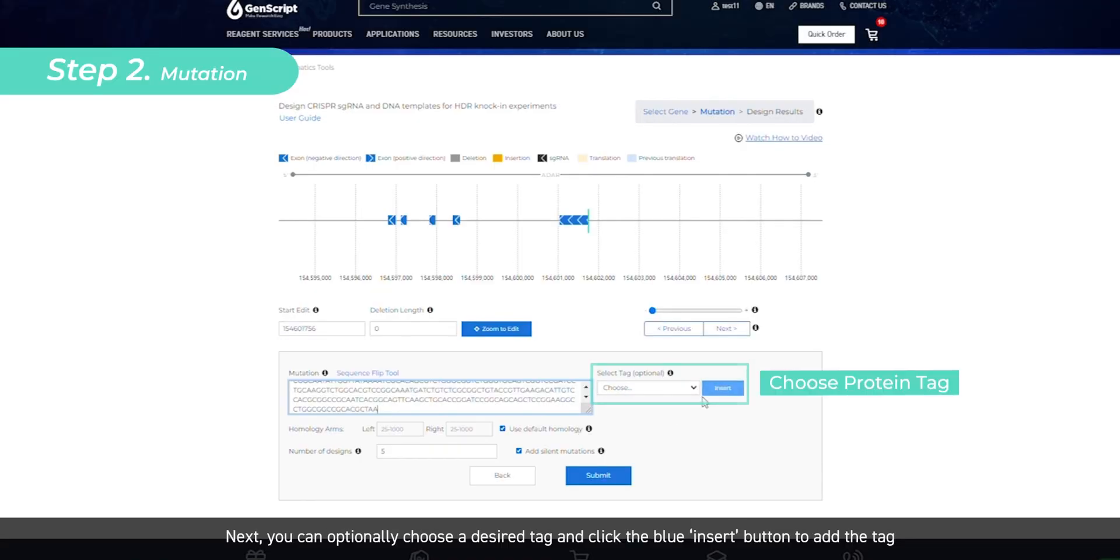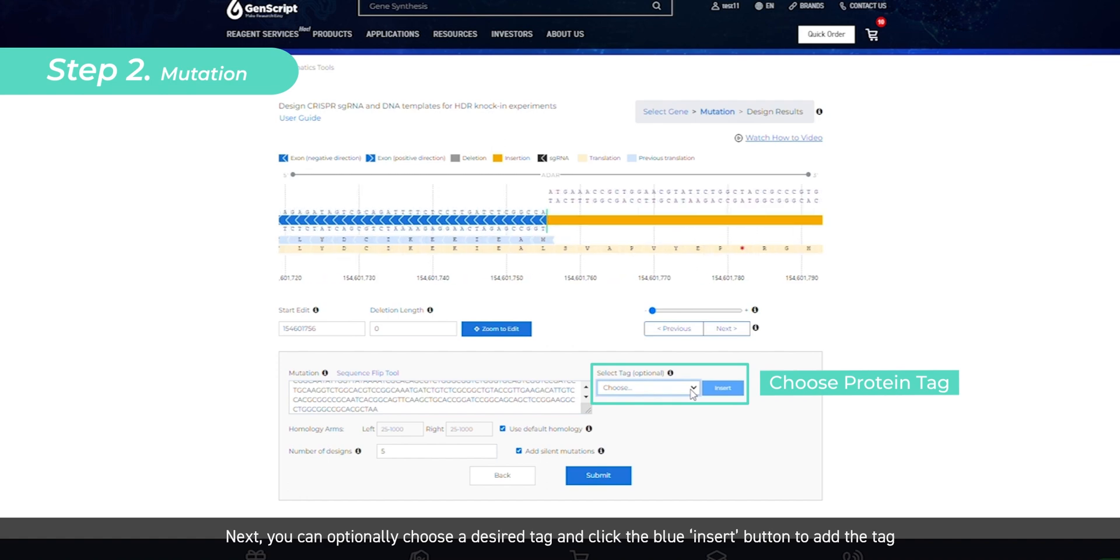Next, you can optionally choose a desired tag from the drop-down list to the right and click the blue Insert button to add the tag.